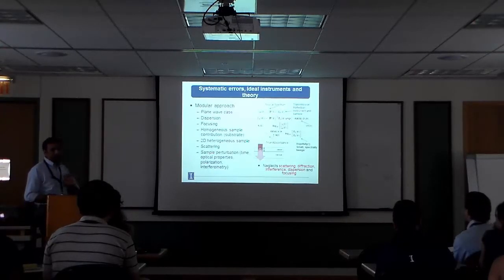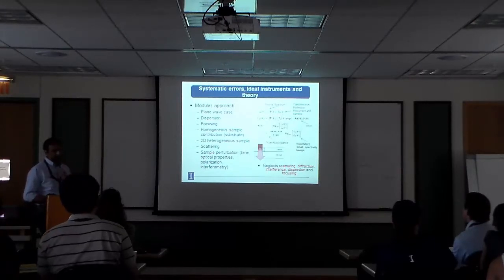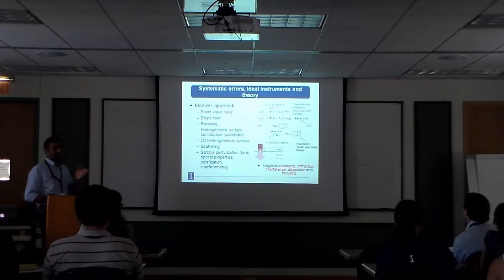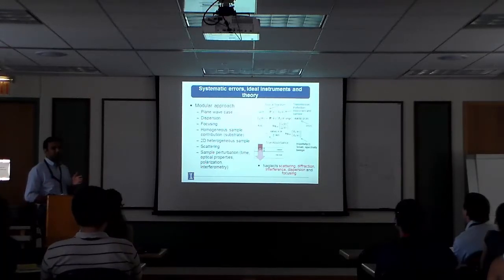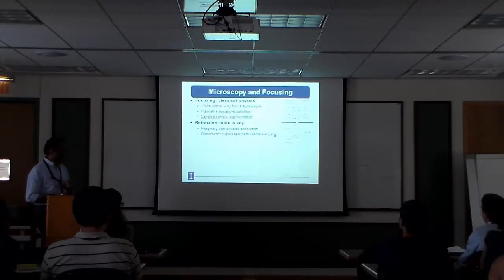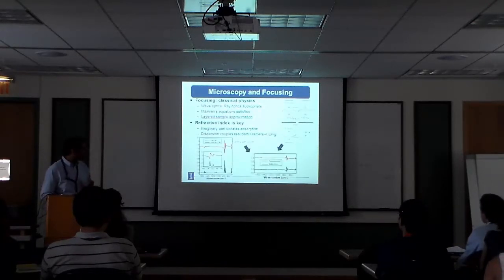So what we have done is really modeled the microscope. I don't know if Scott Carney talked about this at all a little bit in his talk? Okay. Otherwise I can go over it again. What we have done now with Scott is modeled from source to detector the entire image formation process in a microscope using a couple of ways. And I can show you both those ways. So I'll go over this, I think, fairly quickly.